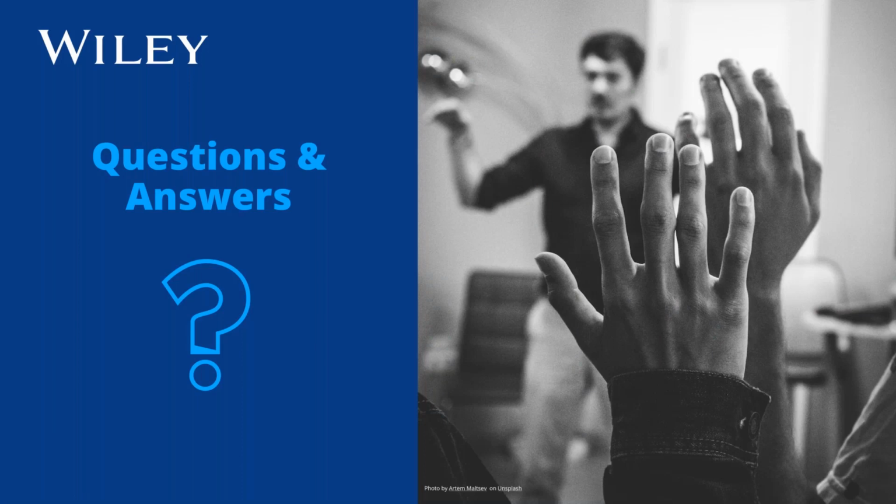We are 21 CFR 11 compliant supportive. That means we do not alter records or change anything. When you generate a report, people can sign, and we add a timestamp and also the license number of who generated it, so you always know which machine generated reports. But to be fully compliant, if you're talking about change control, that needs a lot of programming and uses tools quite differently. So we're not there yet, but we are very interested and watching the direction.